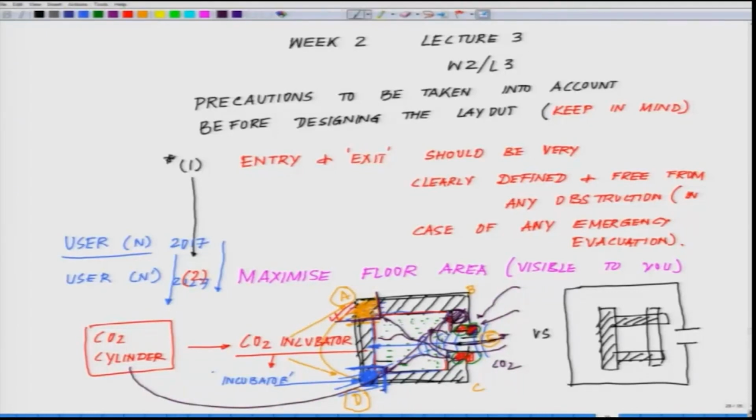It is heavy, so you have to be careful, stack them properly, and whenever you need to take them, just spray them a little bit with alcohol and clean them, and take them from the side, and prefer to follow like this, instead of going through the center. It is not a good idea, because it spoils the floor.